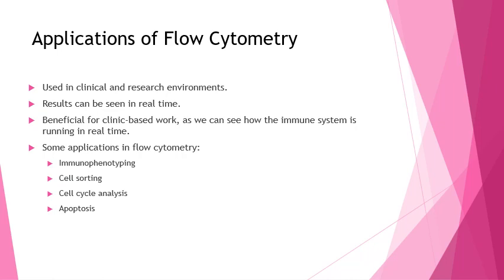So we're able to see how medications are interacting with the immune system, how any sort of effects are happening to the immune system. So it's just really cool that it's kind of like a snapshot. You could take a sample before a treatment or a therapy is done, and you can see how the immune system is. And then you can see again, like an hour later, and you can see how much has changed within that hour. And it's actually quite interesting.